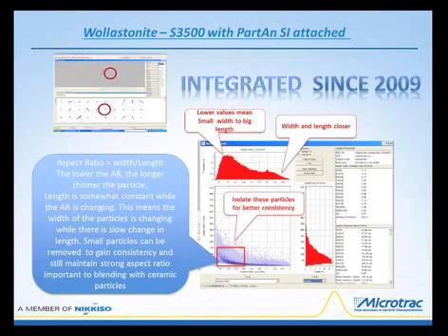Well, there's a lot of information sitting in this microscope slide, but it's difficult to get size and shape information from a microscope. Even an automated microscope would have a difficult time dealing with this situation. So what we did, since we have the SI, which means suspension instrument, is patch it directly in series with the S3500, so we can get the S3500 data at the same time we're grabbing the image analysis. I'm just showing you a couple of screens here. There's much more information that can be gained. This shows some of the photographs from the SI as the image analysis is being taken simultaneously with the S3500 data.